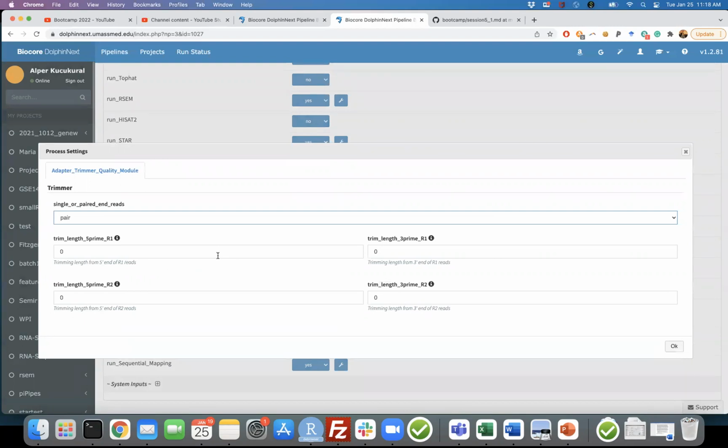You want to remove them, because you cannot align them to the genome if you don't allow errors. Or if you have multiple Ns, then you have to trim the 5' or 3' end of your reads.